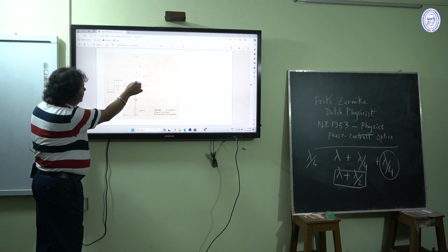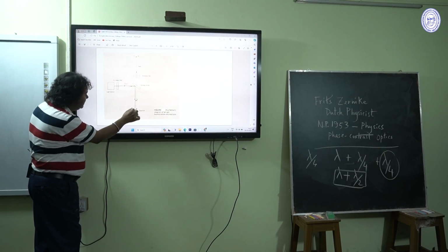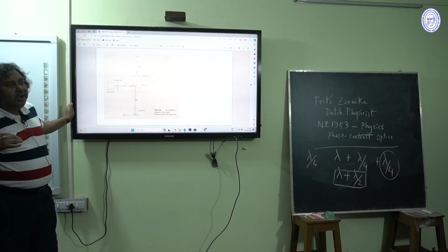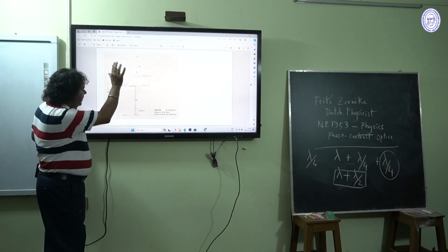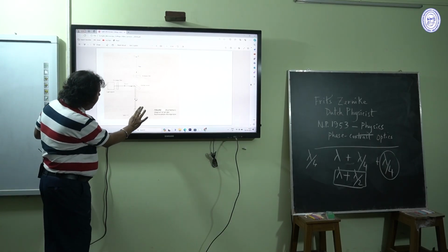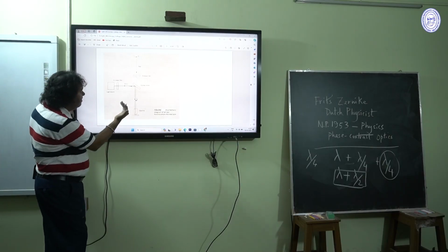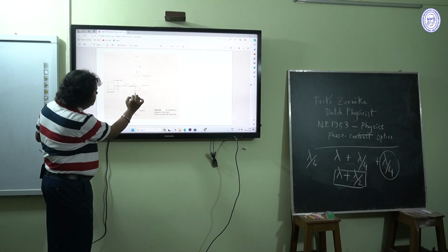After that, it bends, passes through the objective lens and then to the specimen, where the specimen is stained with fluorescent dyes, or it may autofluoresce, whatever it may be. After excitation, the light having higher wavelength passes through the objective.